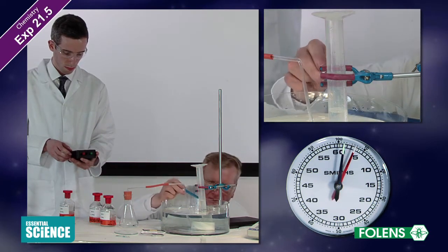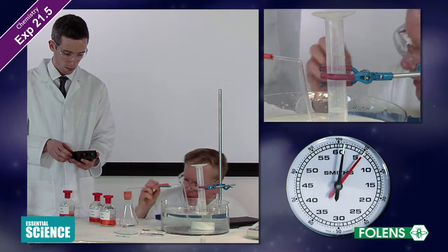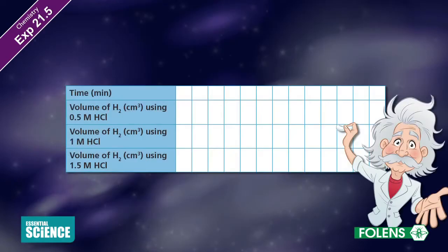When the reaction is over, note the final volume of hydrogen collected and then wash out the conical flask. Record your results in a table similar to that shown on the screen.